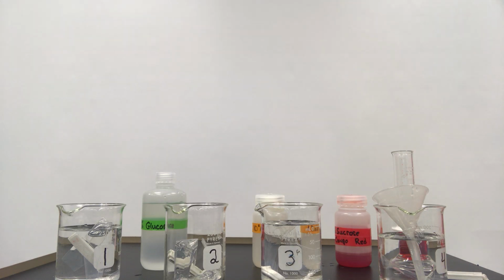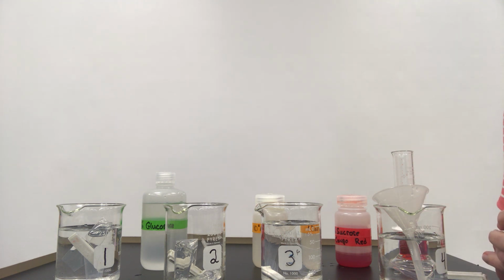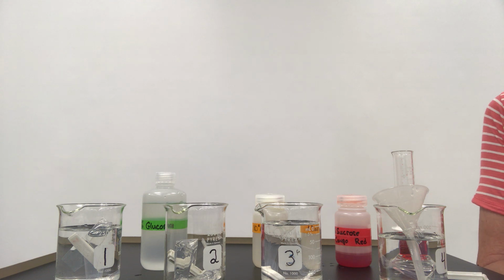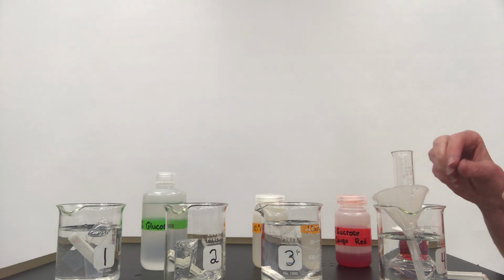Lab 2, we are also going to do diffusion and osmosis, and look at the movement of materials into and out of the cell itself. For this osmosis lab, osmosis is the diffusion of water across a selectively permeable membrane, which is a biological term because the selectively permeable membrane is the cell membrane. We are going to be using dialysis tubing for that.